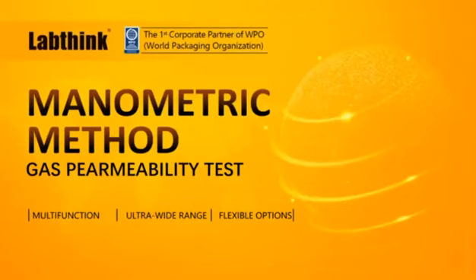As George says, today we're going to be talking about the manometric method of gas permeability testing, or gas permeability analysis or measurement. And this, as we know, is an alternative method for measuring oxygen transmission rate, amongst other capabilities.